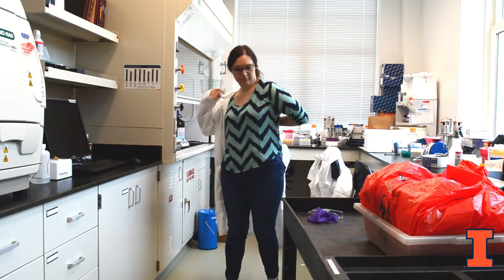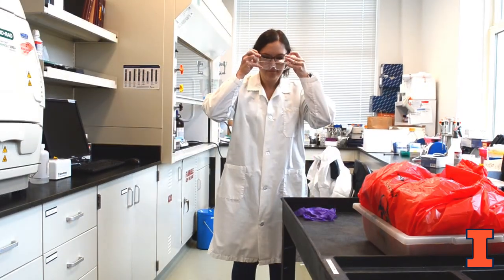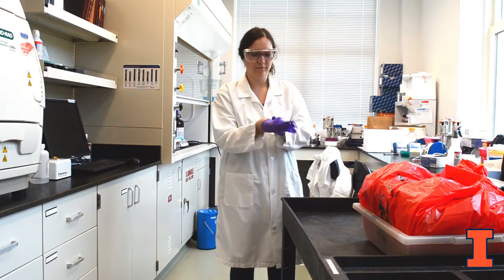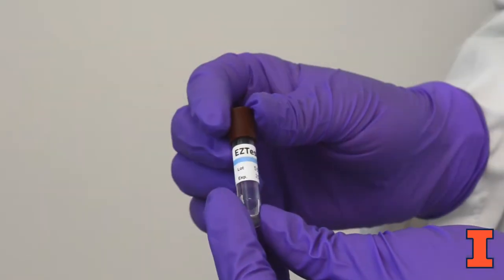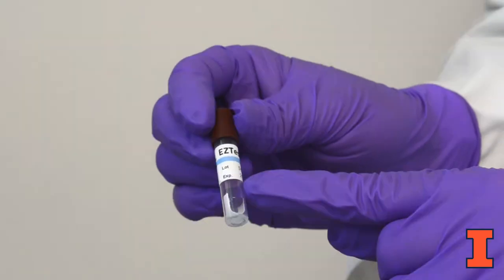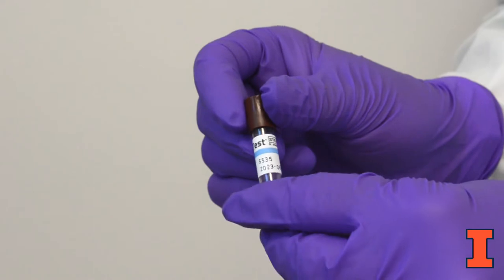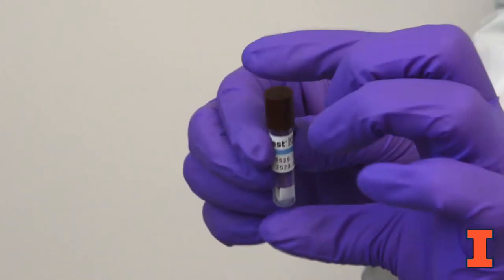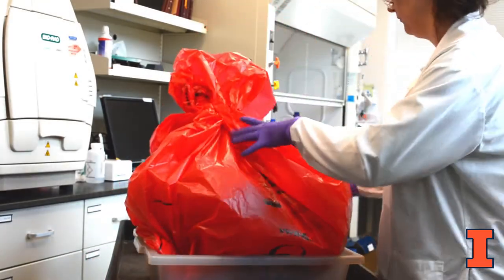To begin the waste validation, don appropriate PPE. If splashes are anticipated when handling the waste, wear full face protection. Open the starter kit obtained from DRS and inspect its contents. Take out the spore vial indicator and check the expiration date. The vial has heat resistant bacterial spores on a piece of paper at the bottom and vents on the top to let steam in while autoclaving. Place your bag of biohazard waste into an autoclave safe secondary container.